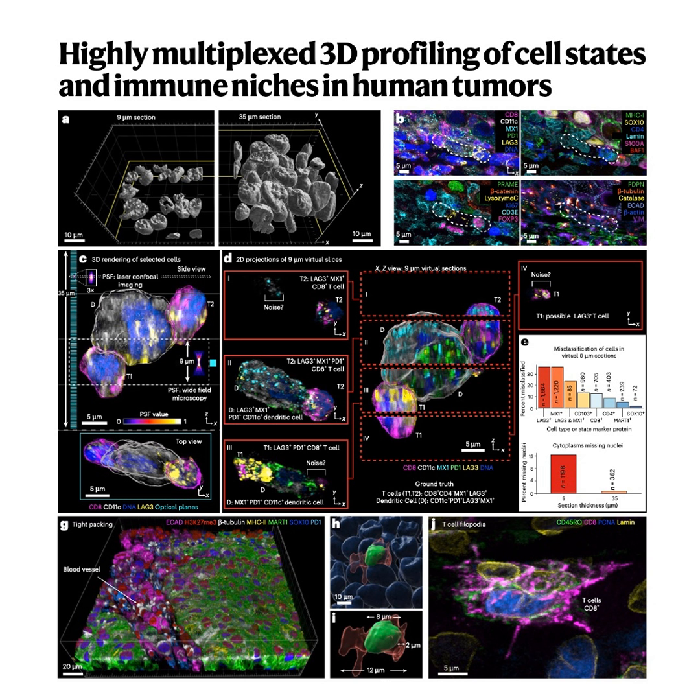Exactly. They showed this beautifully with granzyme B, or GZMB. This is the main weapon, the executioner protein, used by cytotoxic T cells to kill targets like cancer cells. When they looked at CD4 plus T cells, which are more like helper or memory cells, the GZMB protein was present, but it was kind of diffuse, spread out, maybe globular inside the cell, consistent with an activated memory state perhaps, but not immediate killing. But when they looked in CD8 plus T cells, the actual killers, the GZMB was strictly punctate. It was neatly packaged into distinct granules, like little bombs, ready for immediate deployment towards a target cell upon contact.